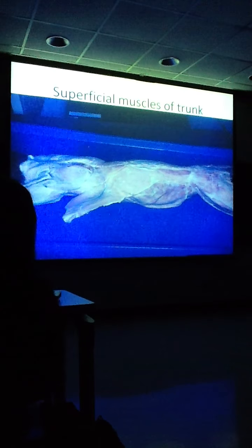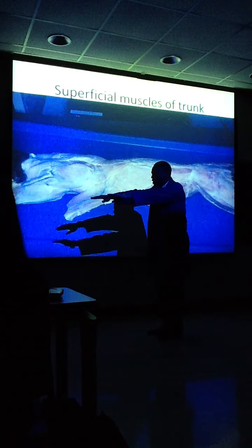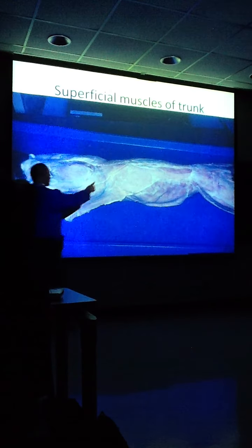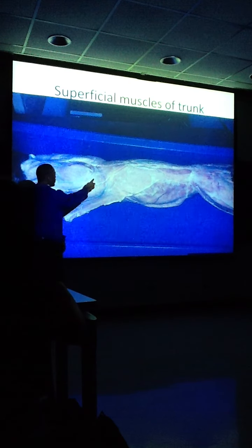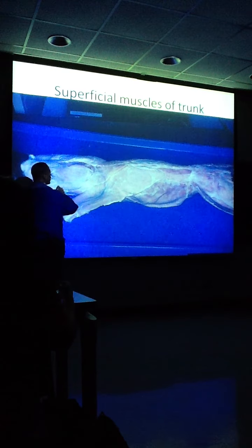When you start looking at it, Mr. Gilmore, you'll notice, here's what we got. Here's his cat. He's lying face down, that's prone, Mr. Gilmore. You'll notice we get to look at musculature here. So here's what we're going to do. We find this muscle, what's his name? Spinal trapezius. This muscle connects to this muscle, Mr. Gilmore. From spinal trapezius goes what? Spinal deltoid.